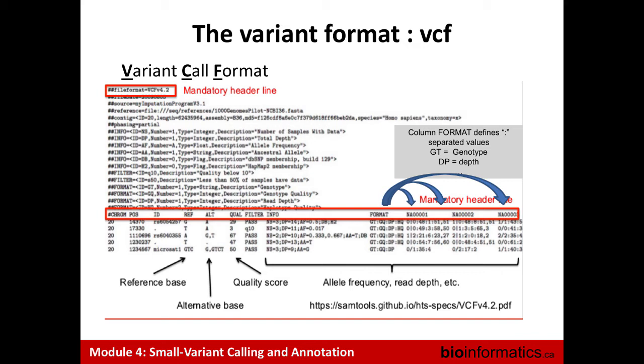Do you need to use a different aligner for haploid genomes, or can you use this one? No, because all the references we are looking at are haploid. You always align your data on a haploid reference, so you don't need a different aligner. When you want to use a diploid reference, then you will have to use some specific aligner or some kit around the aligner to tell it there are two copies of the same region. But for the alignment part, all reference genomes by default are haploid versions of the genomes.